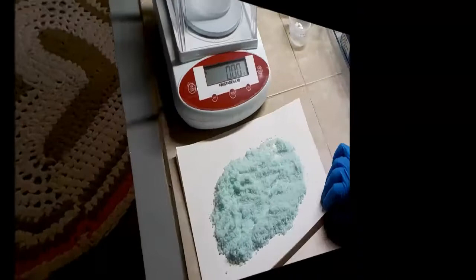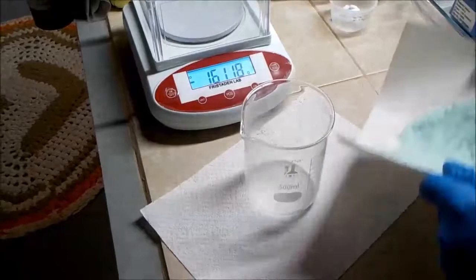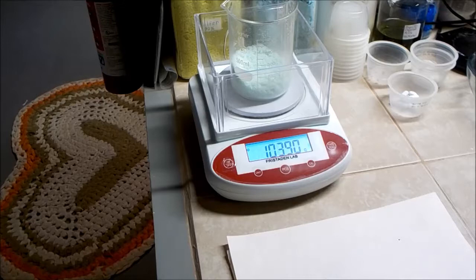So here's the iron sulfate after it's dried. I believe it's dried. So I'll weigh this up and see how much I got. Looks like about 104 grams, and so theoretically I should have had 60.1 grams of iron sulfate anhydrous.